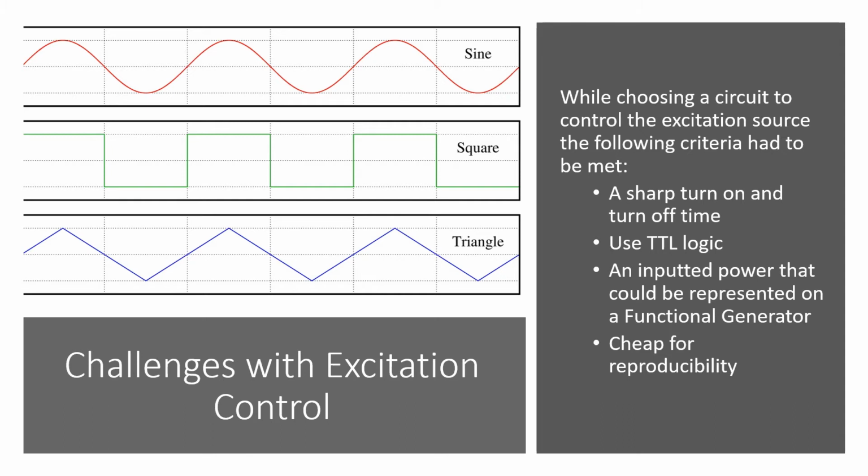And finally, this circuit had to be pretty cheap to reproduce, so that we could make it reproducible in the future so that we could have multiple of these fluorescent spectroscopy experiments.